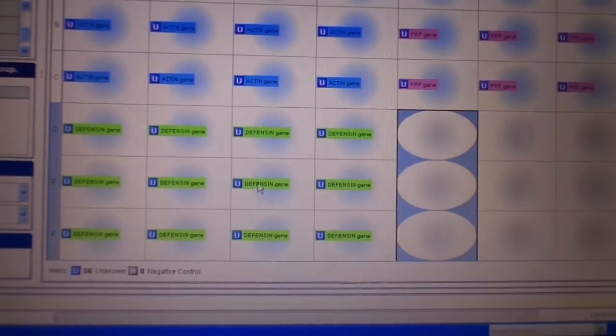We select this, and this select, then select here. So the final one is the 3 plates. The final 3 plates is blank, no sample.